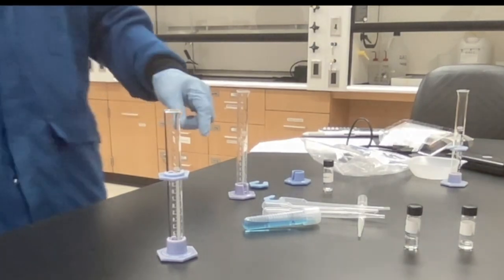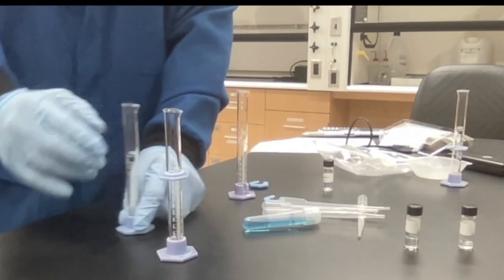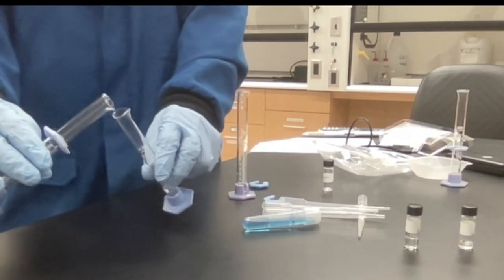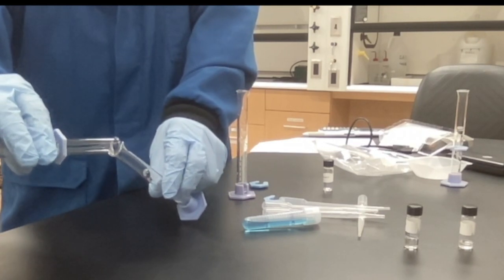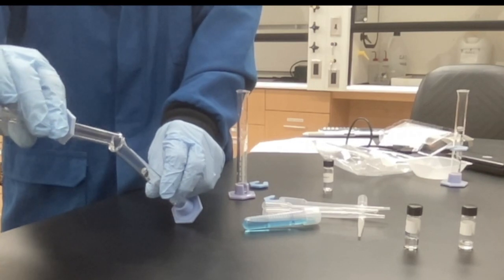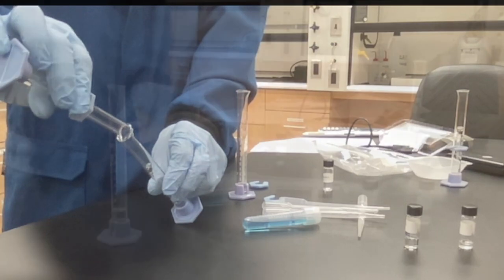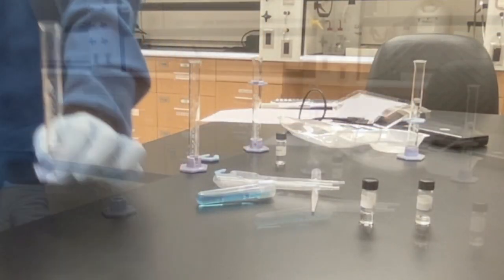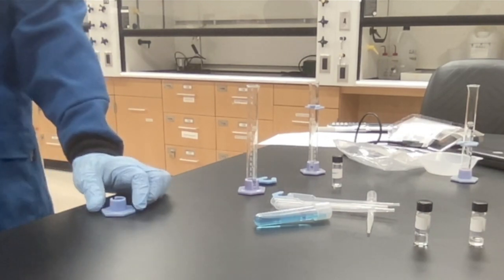Next thing that you're going to do is take the third liquid and then do the same thing. Pour that into the test tube that has the two other liquids. And again, you want to be careful so that they don't upset each other. So now that the three liquids are in, again, just allow the three liquids to settle.